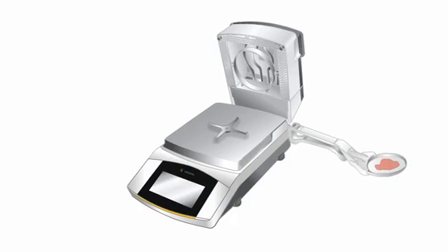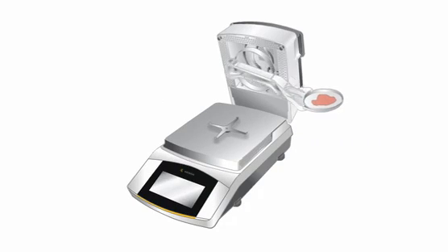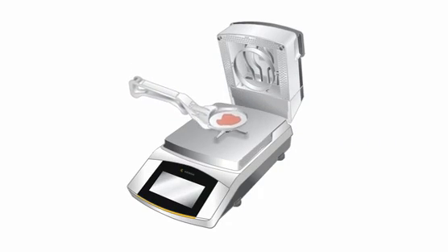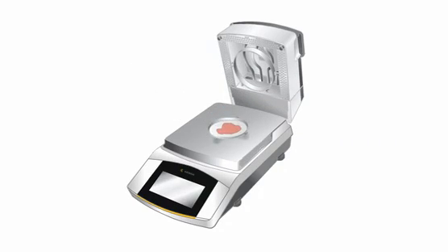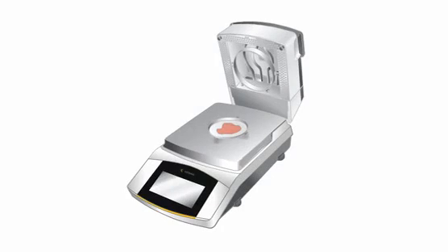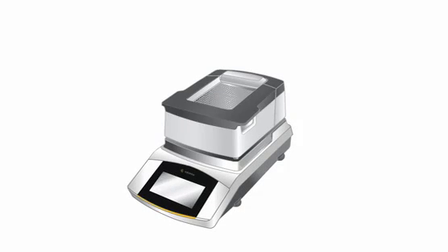Place the sample pan with the sandwich on the sample holder. Now close the hood. The moisture analysis starts.